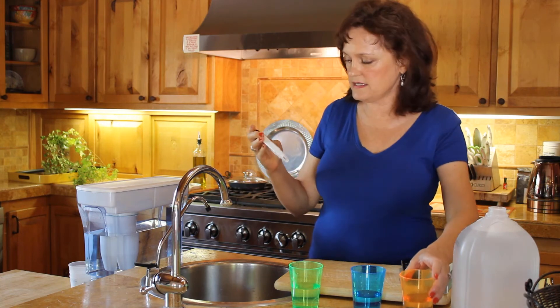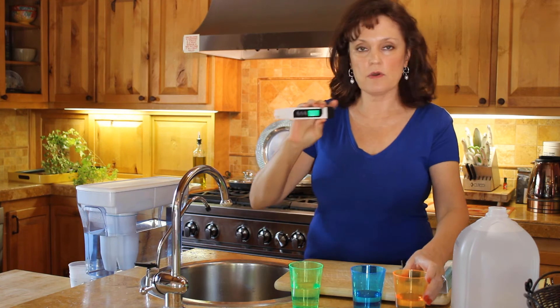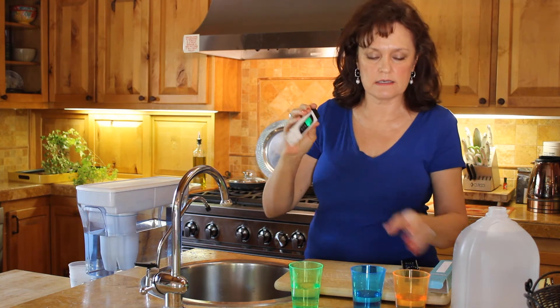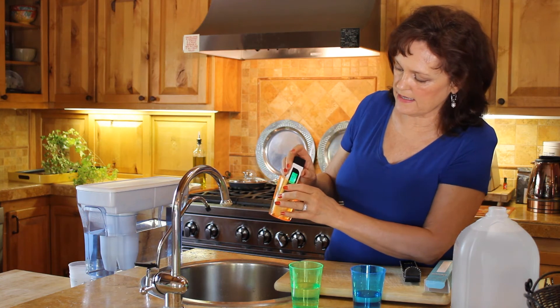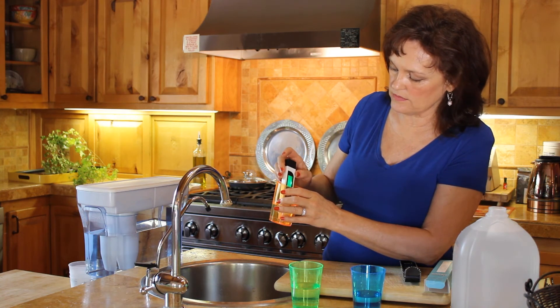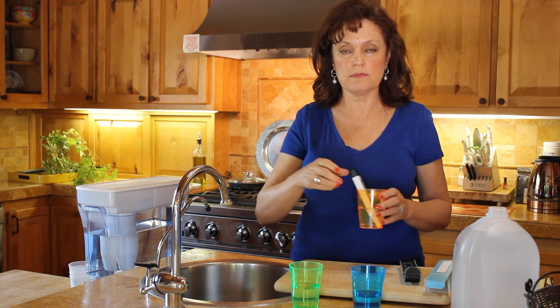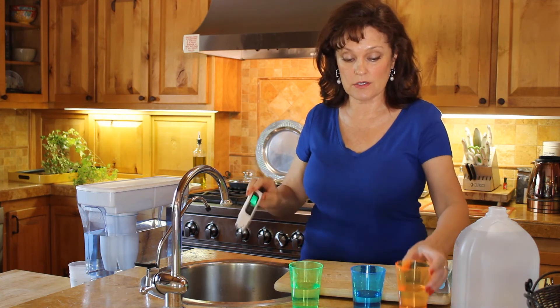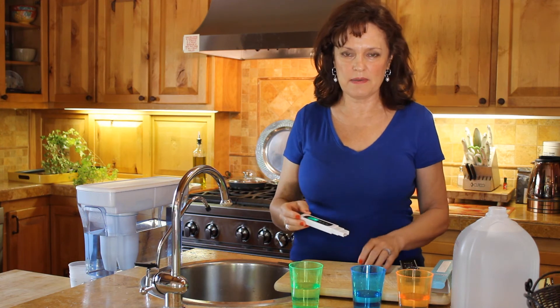And this is your distilled water. Hit the middle button to zero it out, stick it in the distilled water, and it is zero. Distilled water is the steam that rises when you boil it — it's the pure H2O, the two hydrogen molecules with one oxygen molecule. It's the water invented by God, the best water there is.